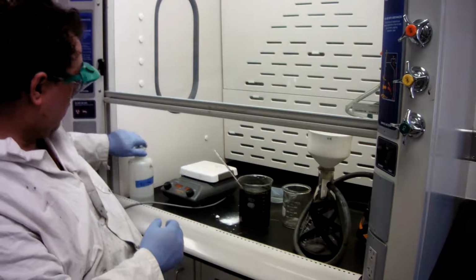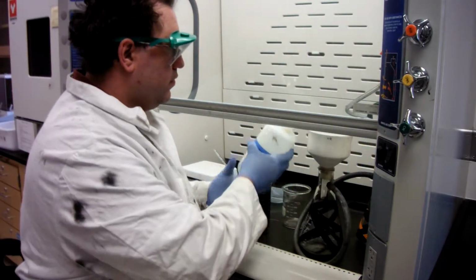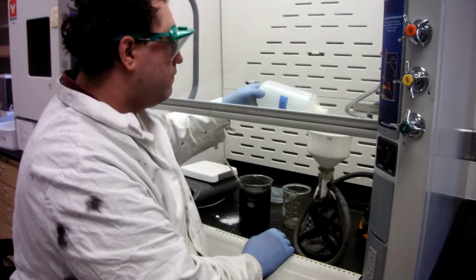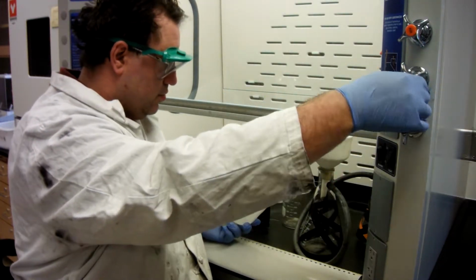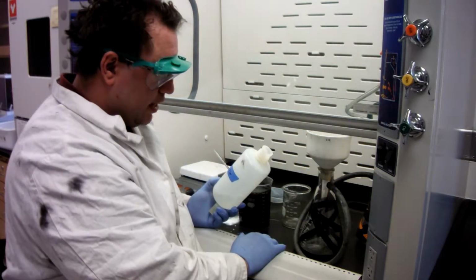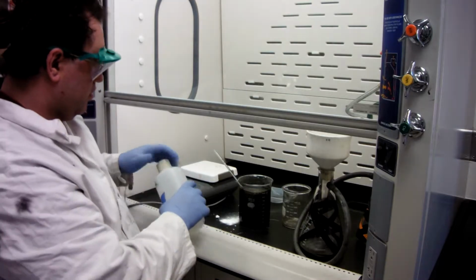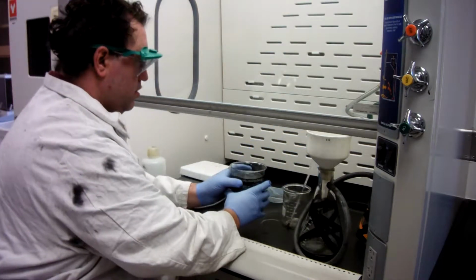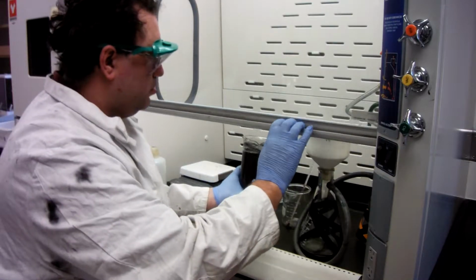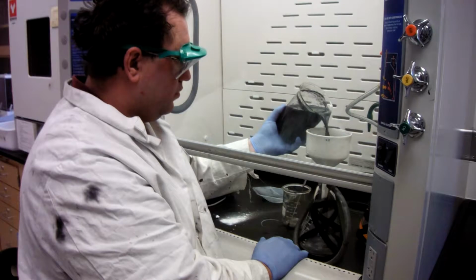We're going to take a little bit of DI water, wet down the filter, and then turn on the vacuum. We should see the water come out. That means our vacuum is working. We then pour our contents through.